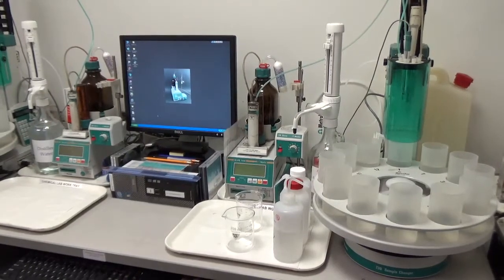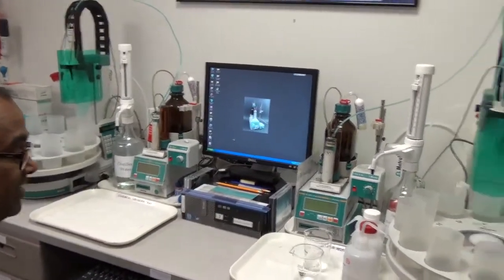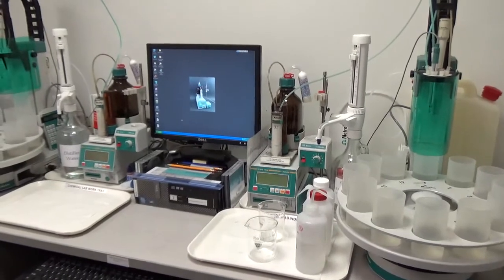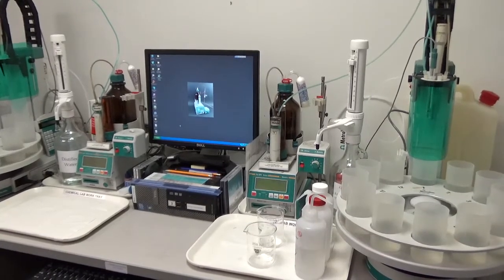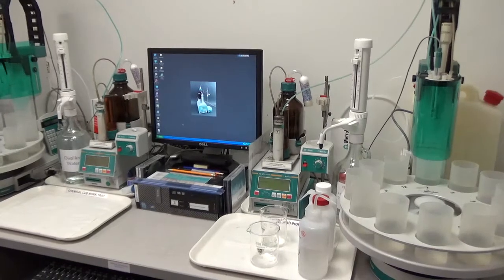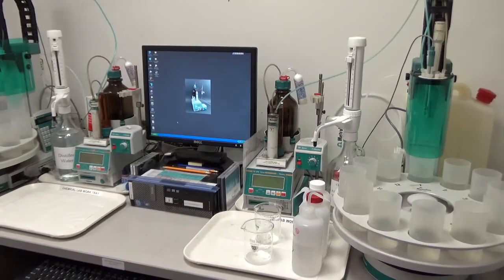We have here two workstations, two setups, to do chloride content analysis in concrete. We do both acid-soluble chloride and water-soluble chloride, according to the procedures of ASTM C-1218 for water-soluble chloride and C-1152 for acid-soluble chloride.